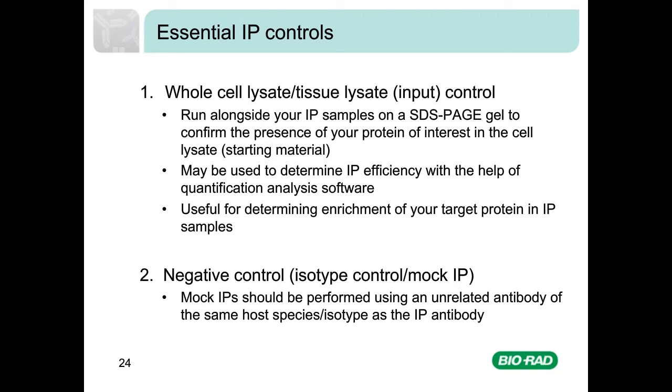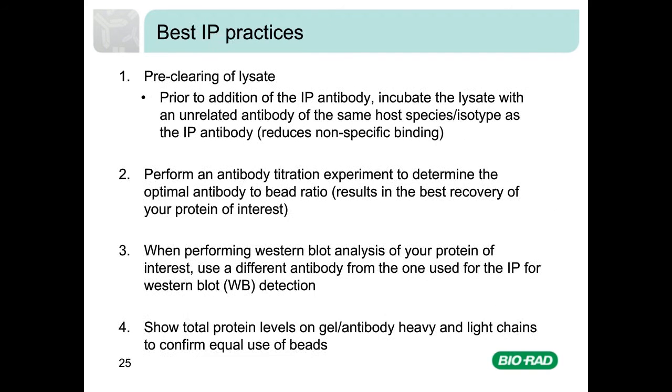I would now like to discuss best IP practices. I have listed four best practices to follow when performing an IP experiment, and we'll start this section by discussing the importance of pre-clearing lysates.